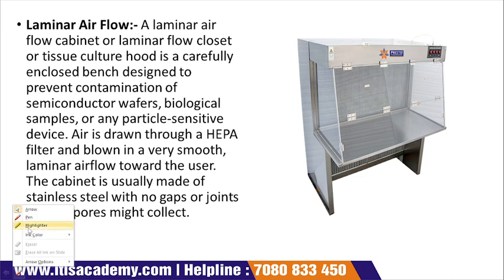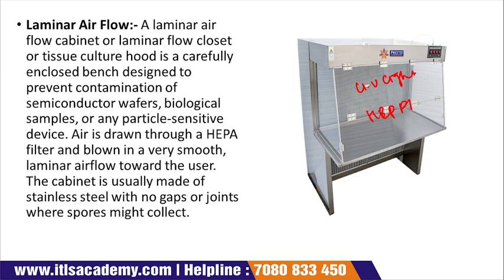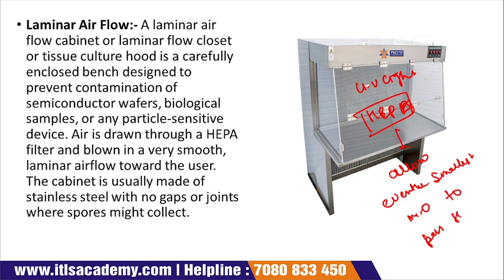The next is your laminar air flow cabinet. The microbial experiment is done in the laminar airflow cabinet. Laminar consists of UV light and a HEPA filter. The HEPA filter does not allow even the smallest microorganism to pass through it.